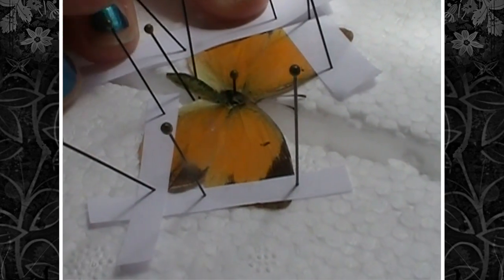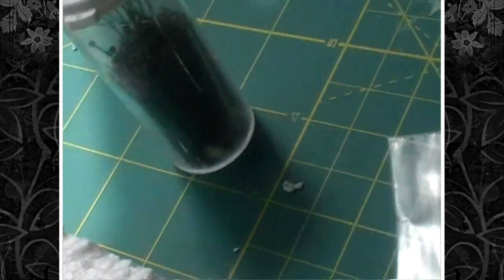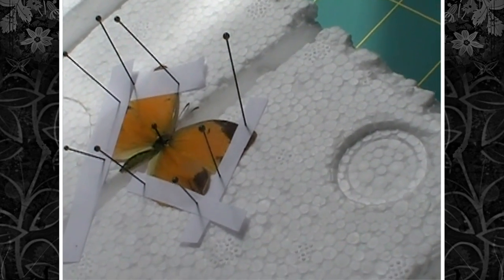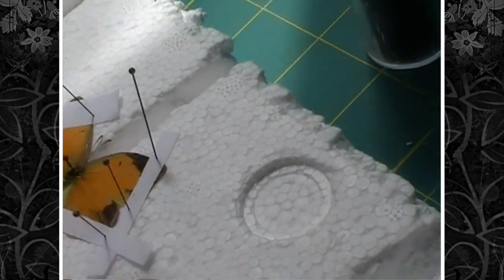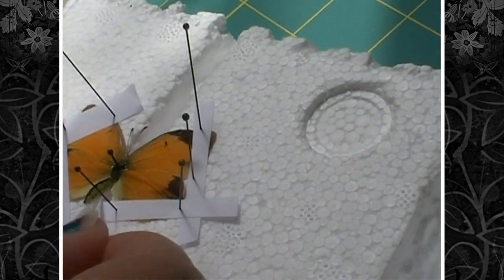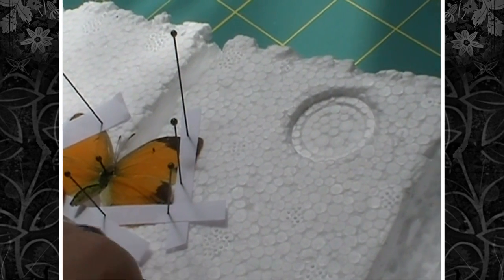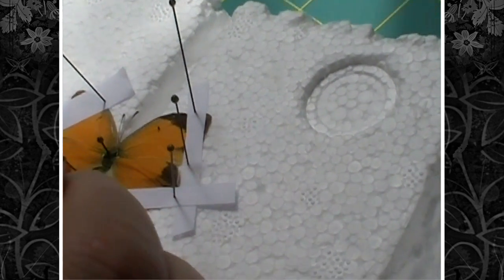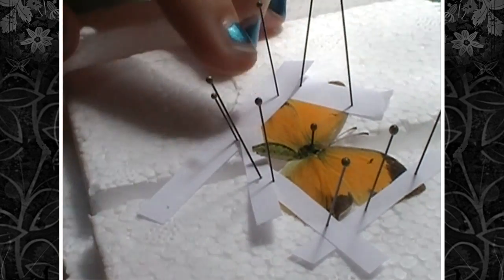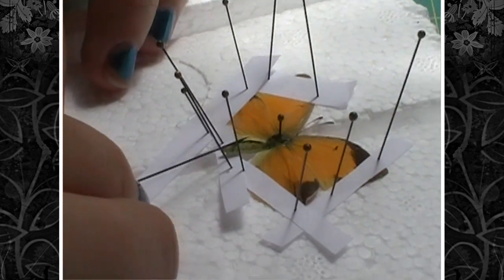And there you have, pretty crudely, a pinned butterfly. You can fiddle around with it a bit more if you want. One thing I like to do is to prevent the abdomen from drooping — I'll take another little slip of paper, slide it under the abdomen, and just pin it down. You'll want to do this for your bigger butterflies and moths, and also your damselflies and dragonflies, because they're so long their abdomen will droop. It's a really easy way to prevent that.